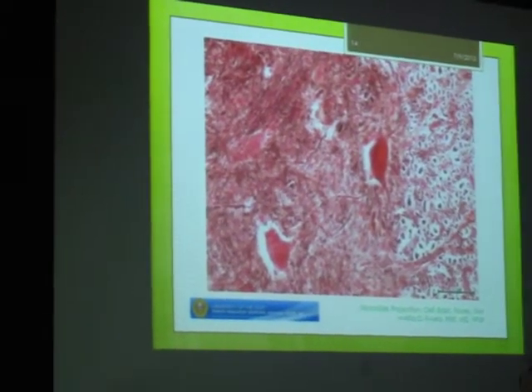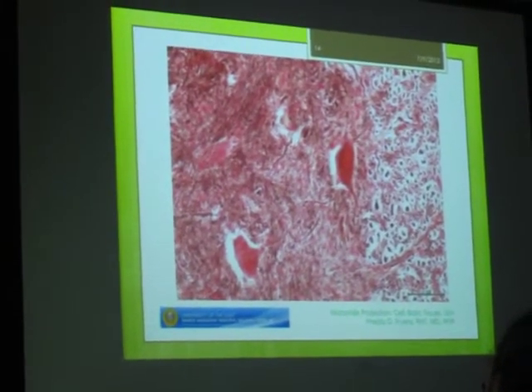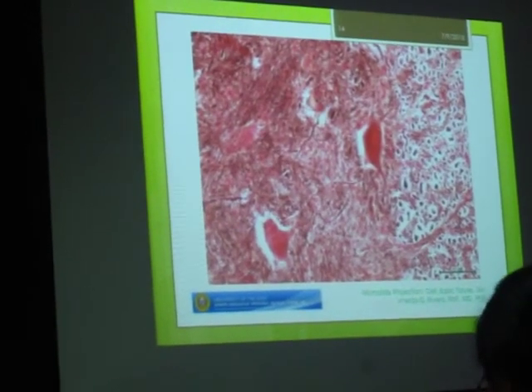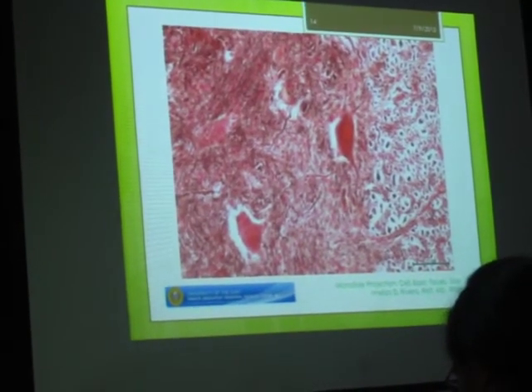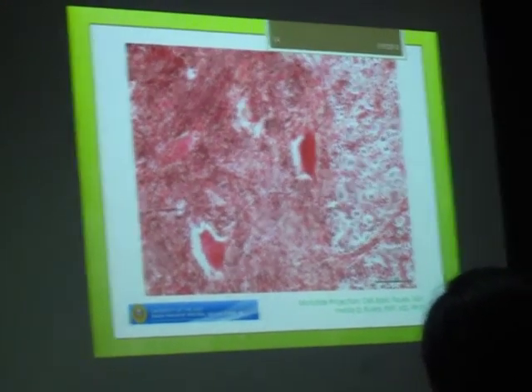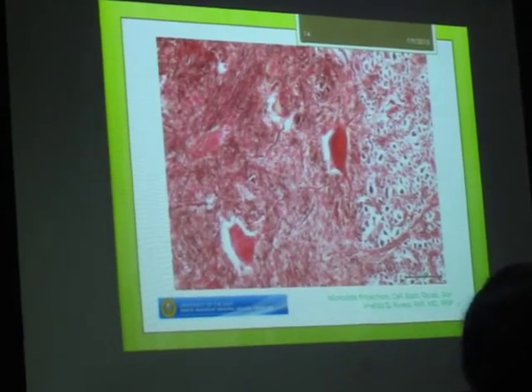That's when we will ask you the cell. Okay. Because you now have the knowledge of those parts. Specifically, example, the retina of the eye. So, alam nyo na yon. But at this point, cell lang ang tinatanong. So, you cannot identify the cell.